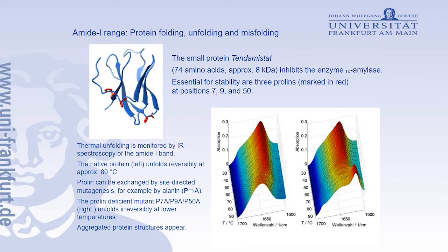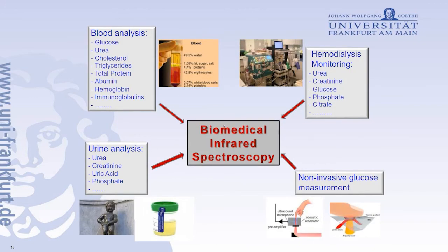Okay, at this point, I will switch to biomedical applications and report a few examples of biomedical applications of infrared spectroscopy, namely the analysis of blood by infrared spectroscopy and non-invasive glucose measurement by infrared spectroscopy.